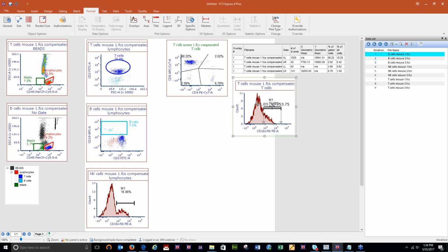See, it won't let me do it. It's just letting me move it up and down visually on the plot, but since these endpoints are linked to the endpoints down here, whenever I move the endpoints on this original marker down here, you see that the marker up there is updating. Okay, so that is also going to be useful. I mean, you can think of many situations when that's going to be useful. Maybe you have isotype controls or positive controls, some kind of control that you want to relate to other plots in your layout. Linking markers might be something you want to try out there as well.